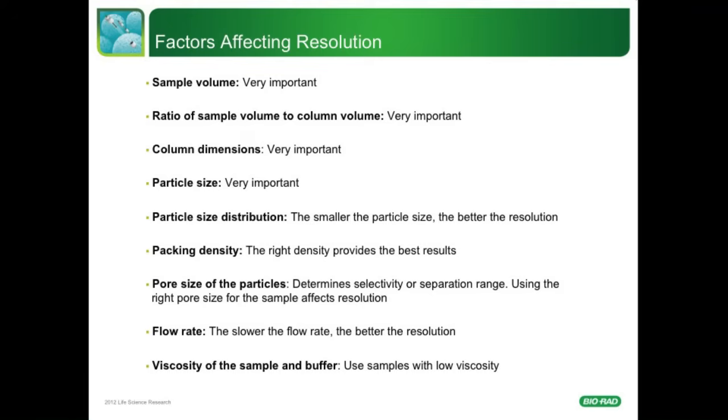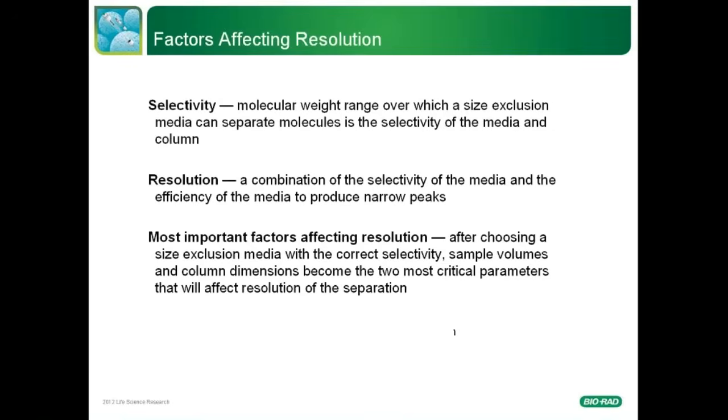Use samples with low viscosity. Factors affecting resolution. Selectivity: the molecular weight range over which a size exclusion media can separate molecules is the selectivity of the media and column. Resolution: a combination of the selectivity of the media and the efficiency of the media to produce narrow peaks.